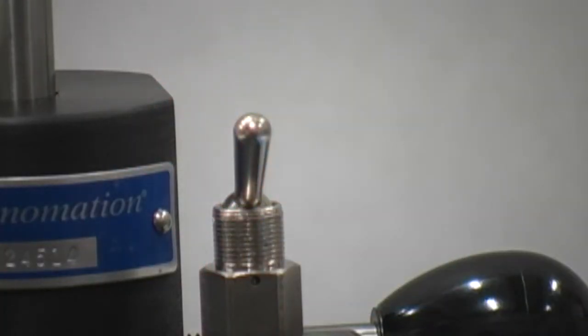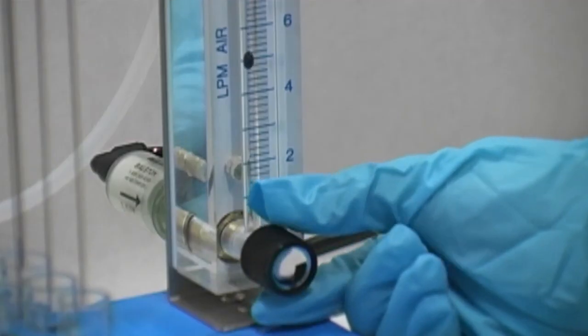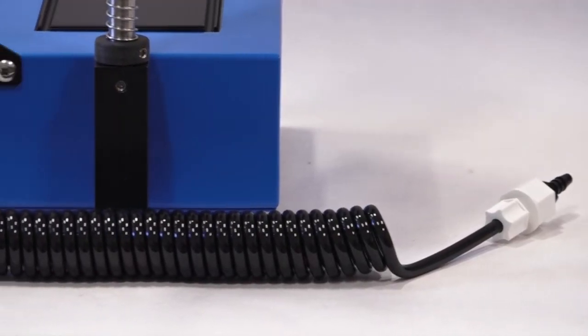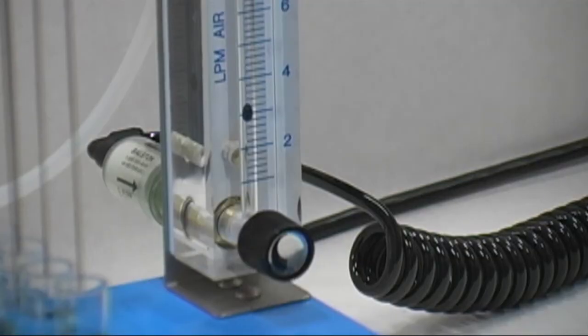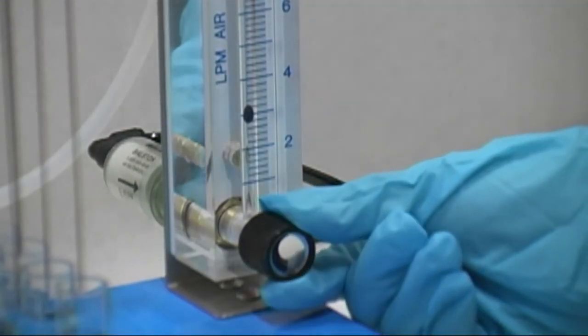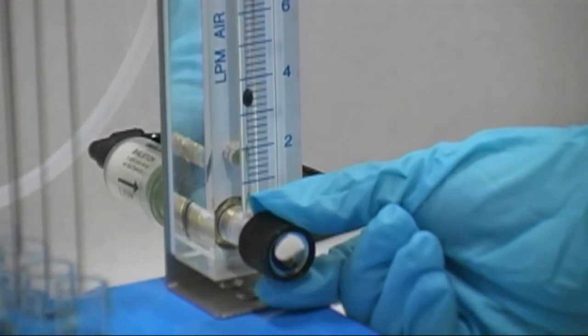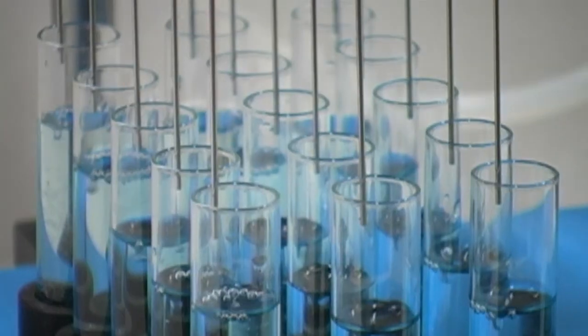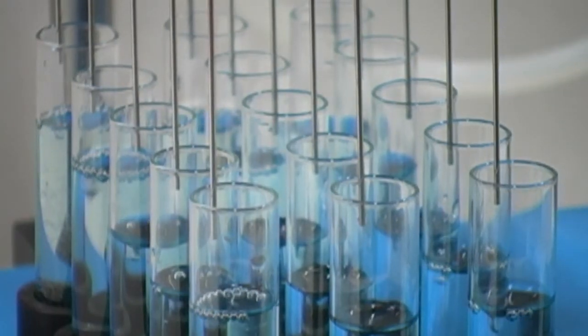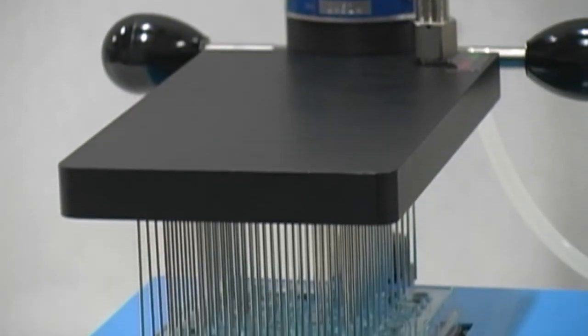Turn the manifold gas valve on. Turn the flow meter needle valve off. Turn on the gas flow to the instrument. Slowly increase the gas flow by opening the valve on the flow meter until a visible dimple appears on the surface of the solution. Evaporate as necessary or until dry.